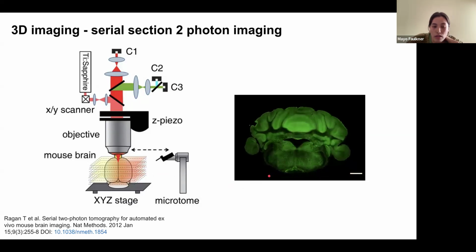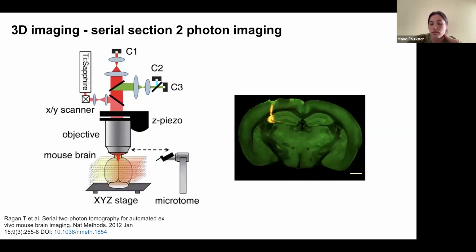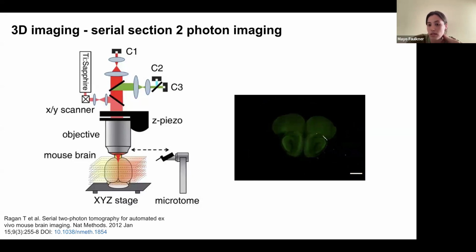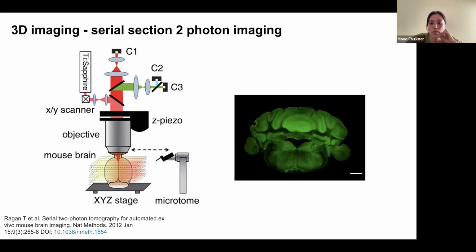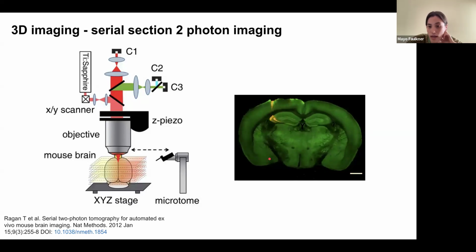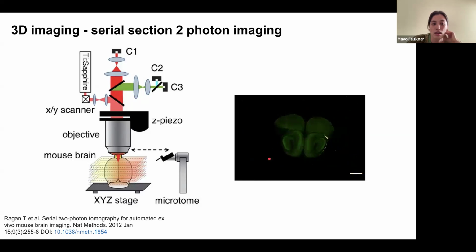So in the IBL, we section at 50 micrometer intervals and then image in 2 planes for each section. So we then get a resolution in the AP stack of around 25 micrometers. So typically you image in 2, green to pick up the autofluorescence of the brain and also the red channel in order to pick up the fluorescent dye track.